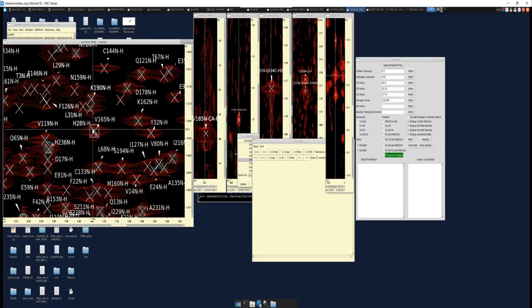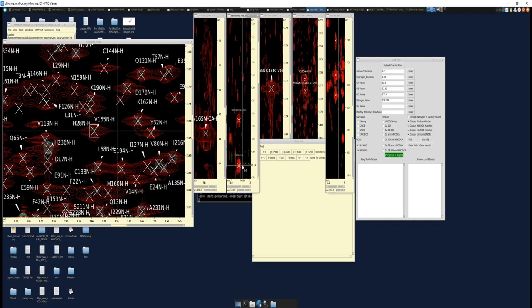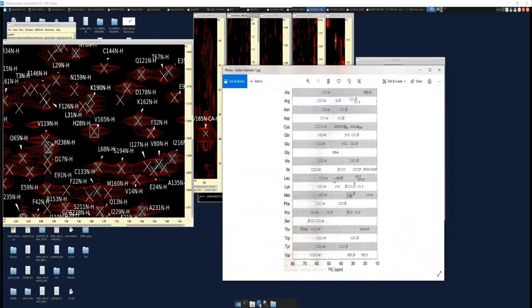So actually, let's close this. So take this valine here, right? An amino acid with a C alpha at 62.8 and 32.14, right? Now, we had discussed earlier about a table that you can actually use to determine what type of amino acid you have, right? So you can use this table here to determine what you're looking at. The problem is, as you can see, this might take a bit of time, and sometimes you get multiple matches and you have to go through it. It's just a lot to look at. Instead, you can have a program just read through the table and give you a printout.